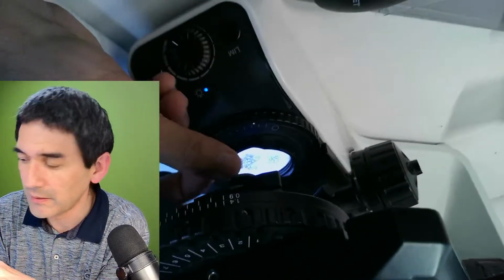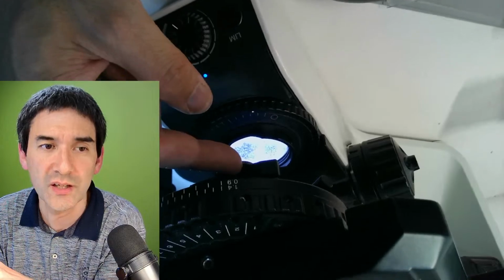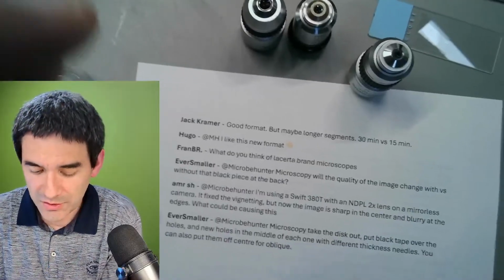How do you say? You cannot see that. I can turn this here. And this one also changes the polarization. So that's a little bit how the setup looks like.